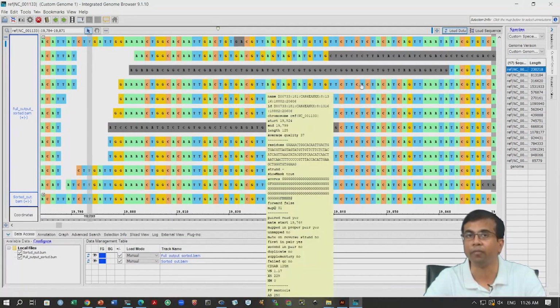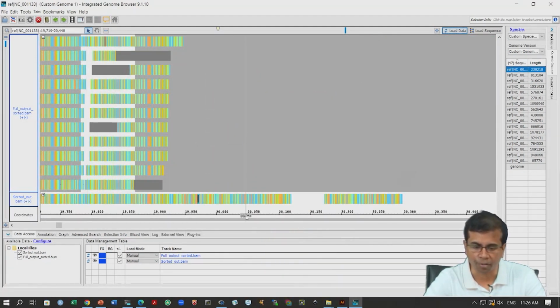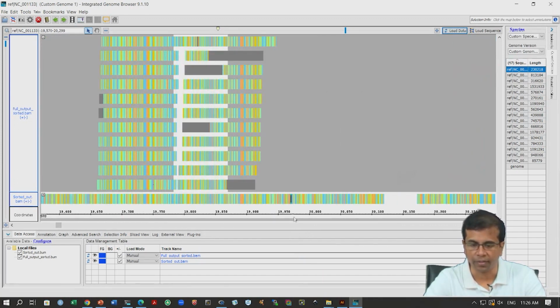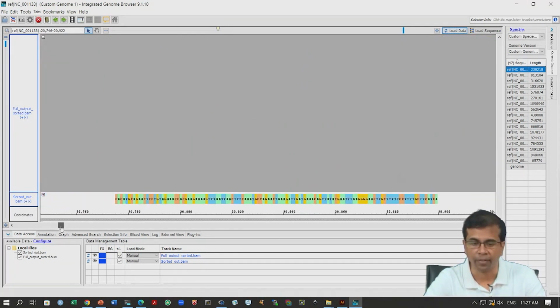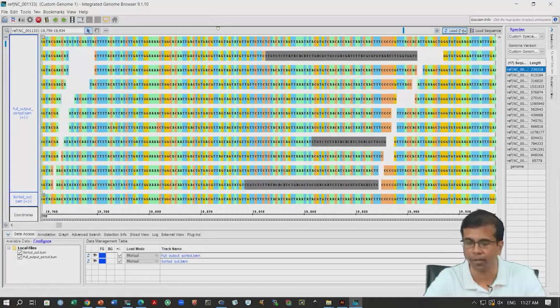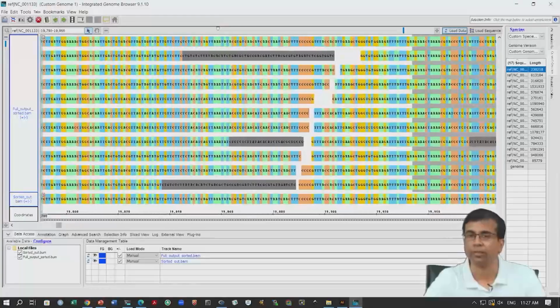So this is the full file, the full output data, and you can see it will look much more complete here. Here is the file which was only part of it. Here is the one with all the reads that I have already aligned and generated the BAM from, and you can see it looks much more complete. I will probably load a bit more data, and you can see this clearly. You have these reads now mapping to almost all positions, multiple reads.